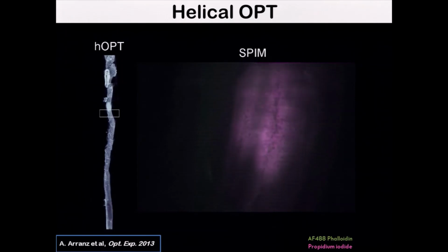So there's a lot of work going on taking organs and clearing them. For example, in this case, we put them in a solution called BABB, Murray's Clear, which is very aggressive. What it does is basically destroy all proteins and the tissue becomes transparent. So if you have a fluorescent protein that you're interested in imaging, it also destroys this.